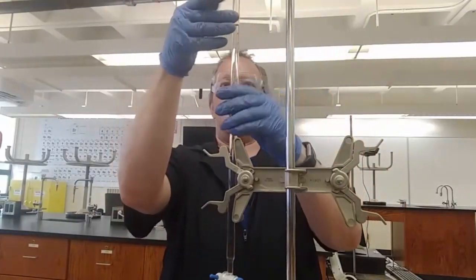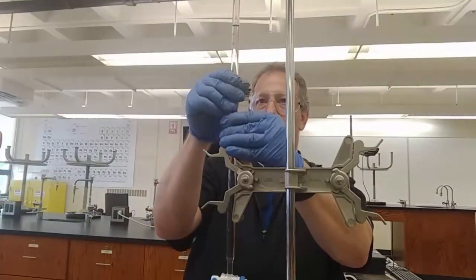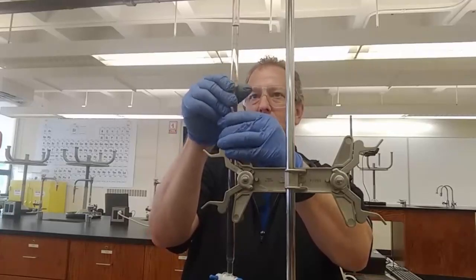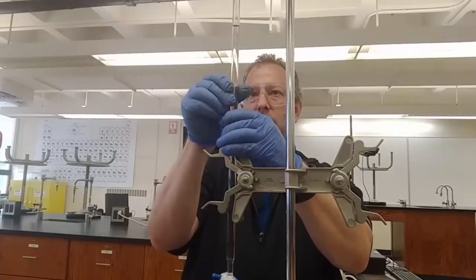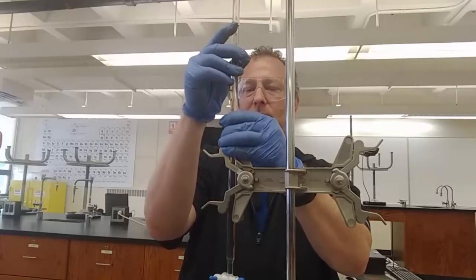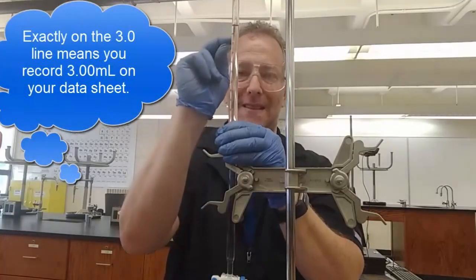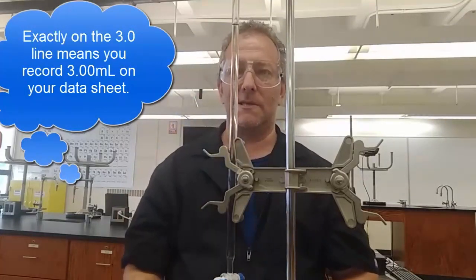And this is somewhere between 3 and 4 milliliters. And actually, it's between 3.0 and 3.1. You know what? Actually, I think it's exactly on the 3.0 line. Yeah. It's not between 3.0 and 3.1. It's exactly on the 3.0 line. And what that means is it's not 3.0 or 3.1, it's 3.00. Okay, I have to record that extra decimal place. It reads in tenths. I have to record to the hundredths. This is 3.00 milliliters is my starting value.